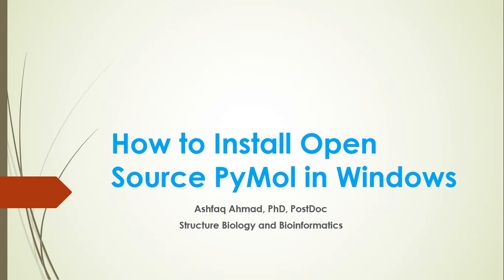Today I will teach you how to install open source Pymol in your Windows machine. It will be just a 5 to 10 minute video and I will give you a detailed overview of the step-by-step installation.